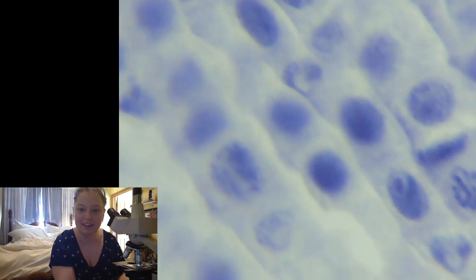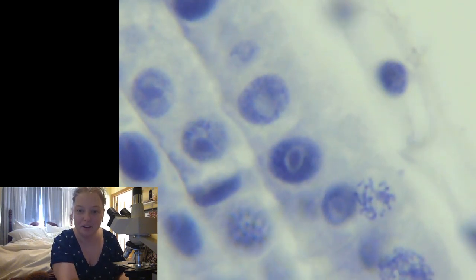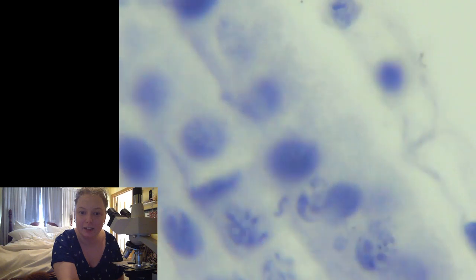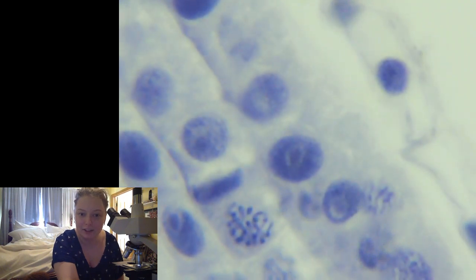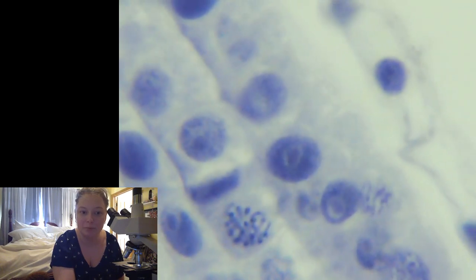Hi, Sophie. All right, so here we go. We've got some, you can see some chromosomes around. Hopefully you're remembering those from our genetics unit too. You can see them, if you're seeing them condensed like that, that's a cell that's getting ready for or in mitosis.